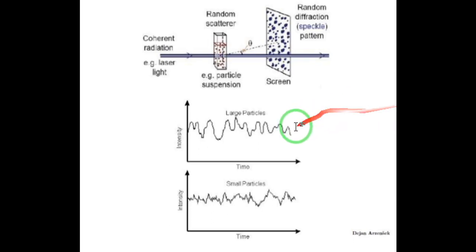The first one is that as you see here, we have the light intensity which is fluctuating over a mean value. Of course, for this data set that we have here over this time, there must be a mean value around which the light intensity is fluctuating. So I want to introduce a line here and consider it as the mean value of the light intensity.